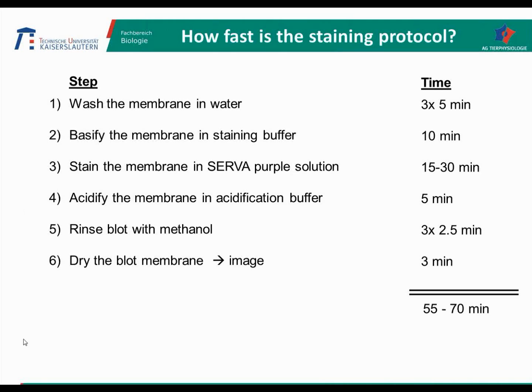You see that there are 6 steps. The first step is just a washing step, then some incubation step in staining buffer. Then this is the actual staining step, the longest one, with 15 to 30 minutes. Then an acidification buffer. By the way, the buffers are quite simple, so they need not much time, only 1 to 2 ingredients per buffer. Then there's a methanol washing step and drying the blot membrane before you can image. Altogether, this staining protocol lasts about 1 hour, plus or minus some minutes.